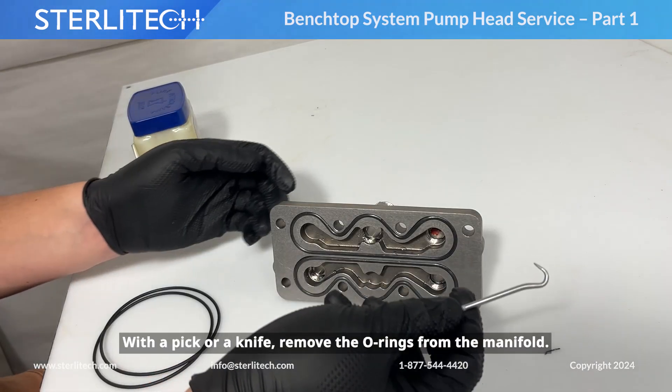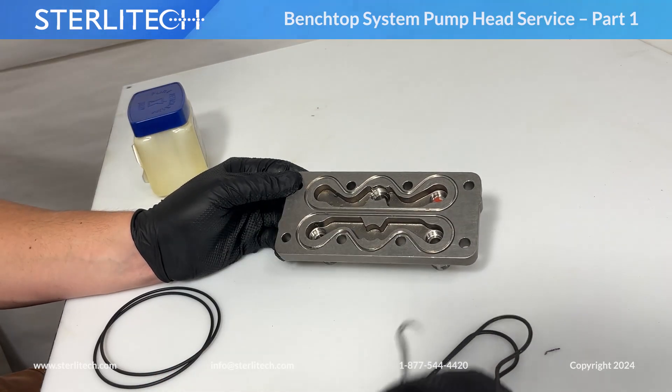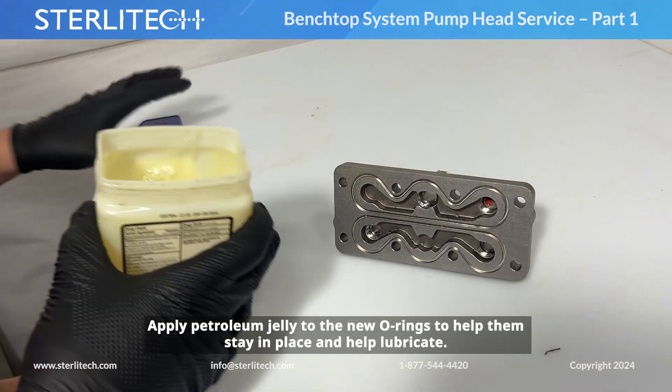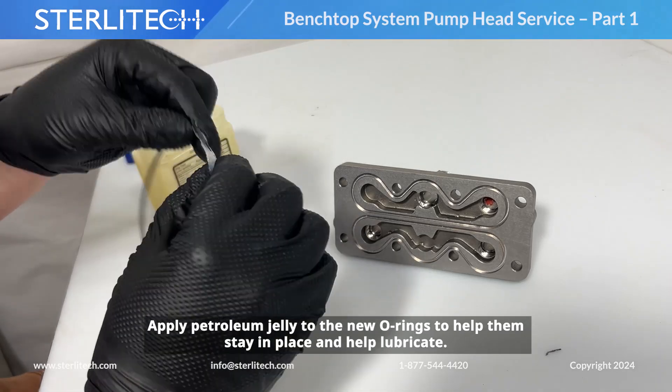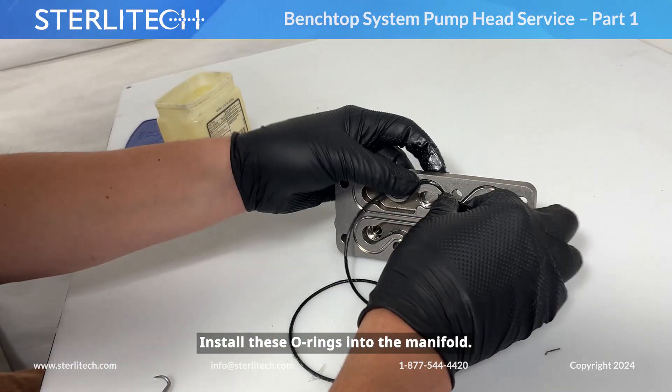Next, with a pick or a knife, remove the O-rings from the manifold. We're going to apply petroleum jelly to our new O-rings to help them stay in place and help lubricate. Then go ahead and install these O-rings into our manifold.